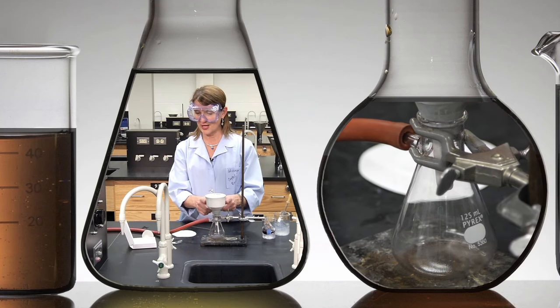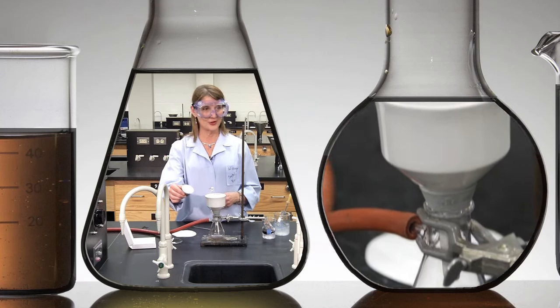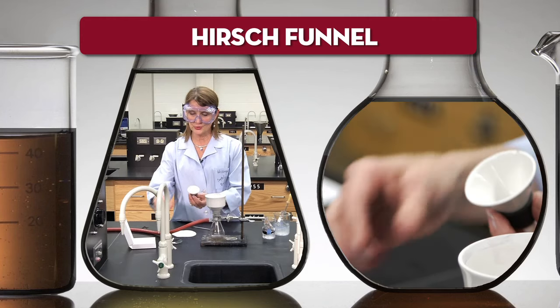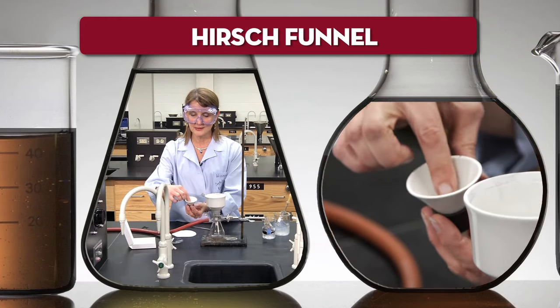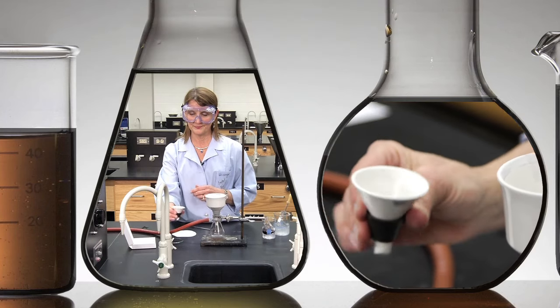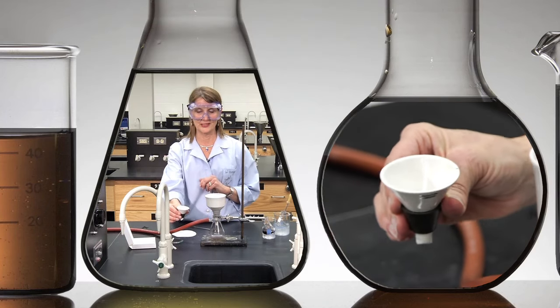Alternatively, for smaller batches of crystals, we use the Hirsch funnel. For this, you want to choose the small pieces of filter paper that fit snugly on top over the porcelain holes.